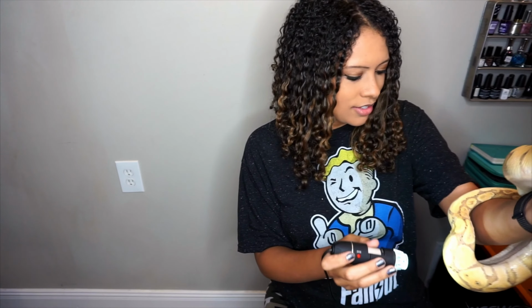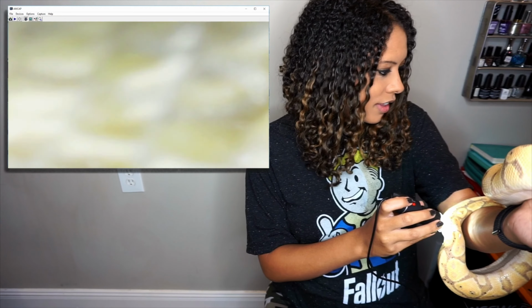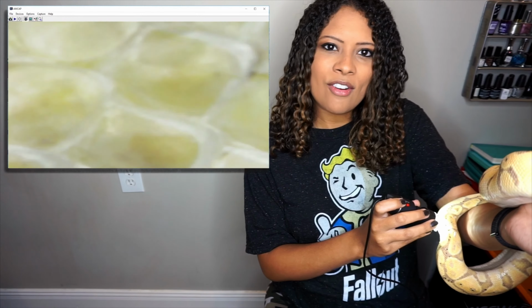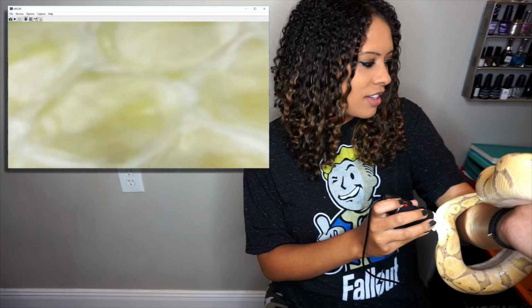And let's look at some of that shed that's coming off and see how that looks. Oh, you can kind of see where they border around the scales. Zoom out. You could see the lens when it zooms out, which is kind of weird, but it's fine. You can see that's where the shed is coming off, and that's where his body is. That's so cool! Okay, I'm obviously just going to be doing their backs and their tails and stuff. I'm not going to magnify anything in their faces or anything like that.